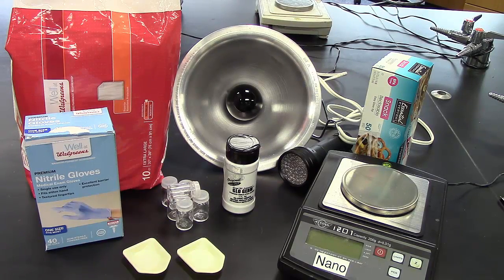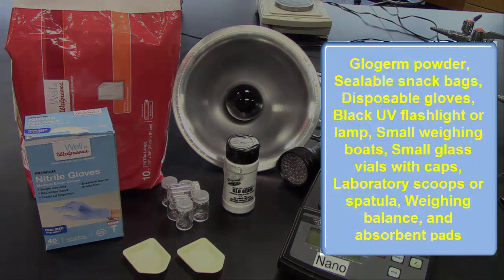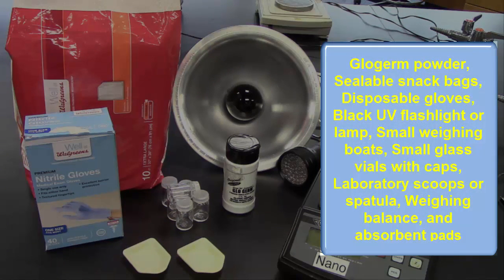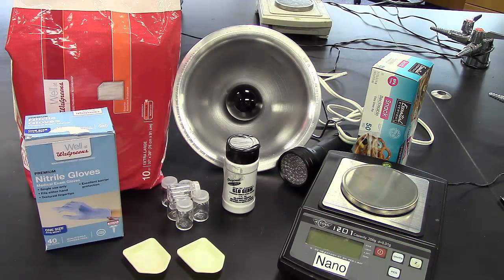To get this activity started, you will need Glo Germ powder which can be purchased from Amazon.com, sealable snack bags, disposable gloves, a black UV light source from either a UV flashlight or lamp, small weighing boats, small glass vials with caps, laboratory scoops or spatula, a laboratory balance for weighing, and absorbent pads that can be used over a bench top. You may need an extension cord and power strip if necessary and be sure to have a sink nearby for clean up.